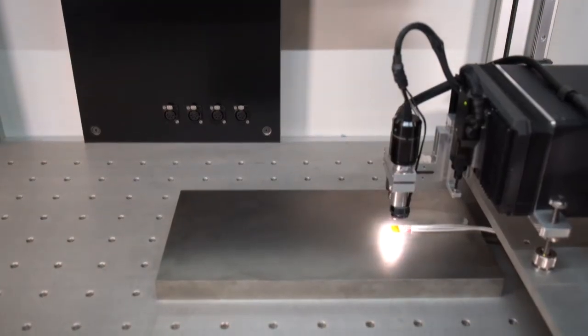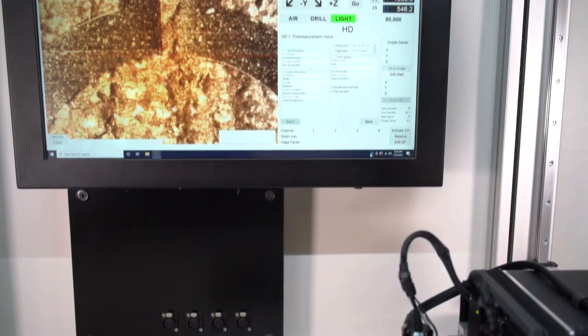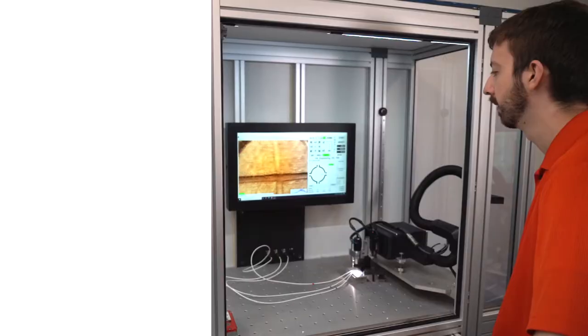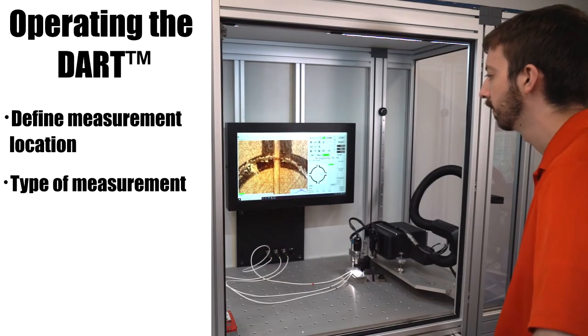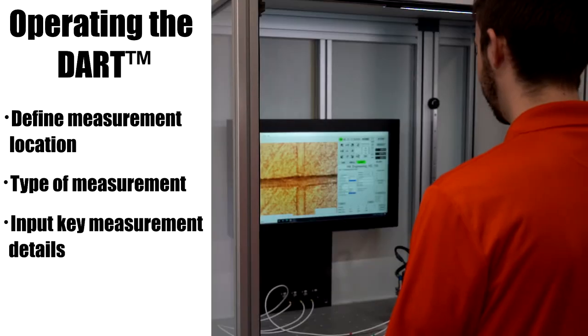DART software is designed for ease of use while maintaining flexibility to meet your measurement needs and providing controls to maximize reliability. An operator defines the measurement location, the type of measurement — true slot or hole drilling — and inputs the key measurement details.